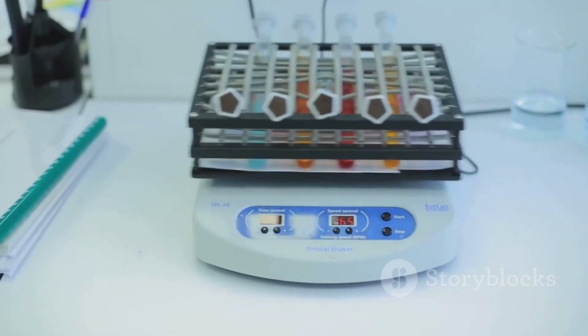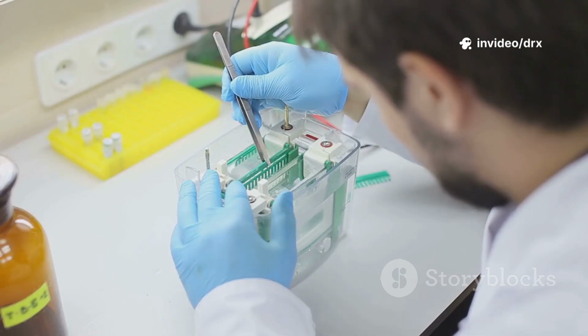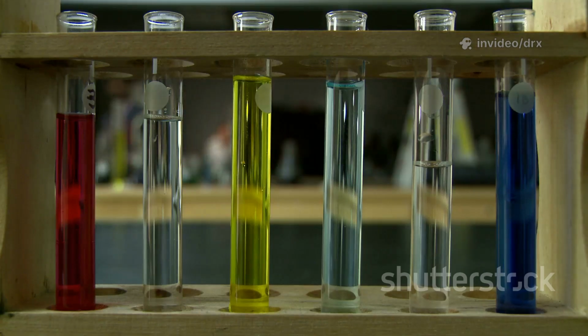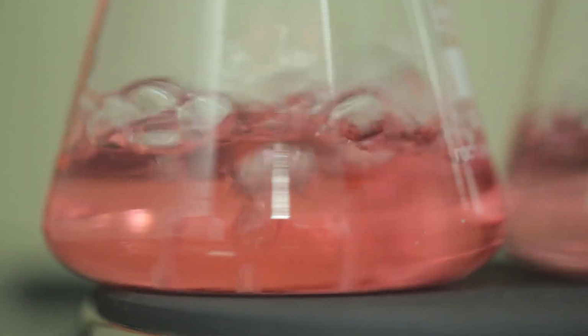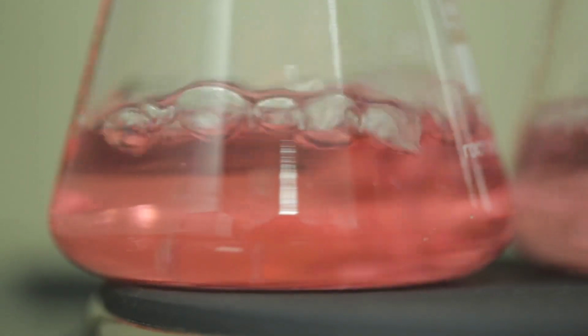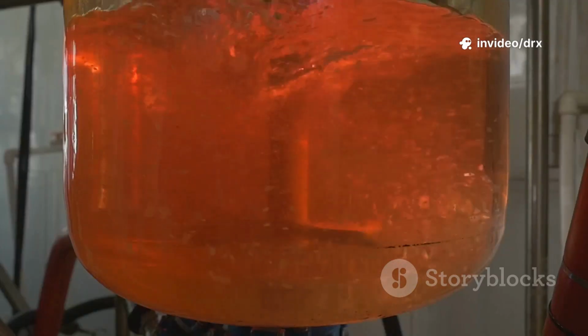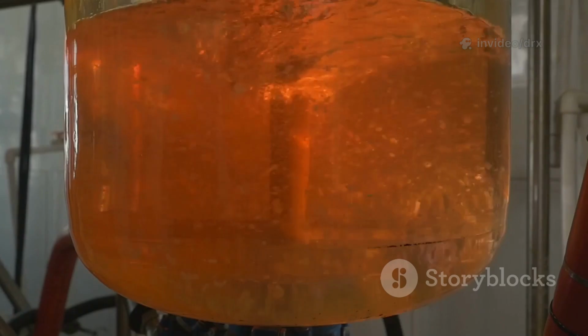But weak acid versus weak base? That's tricky. There's no sharp endpoint, so potentiometric detection is a must. Speaking of indicators, here are the most common ones I use. Phenolphthalein changes from colorless to pink between pH 8.2 and 10. Methyl orange shifts from red to yellow in the pH range 3.1 to 4.4. And bromothymol blue goes from yellow to blue between pH 6 and 7.6.